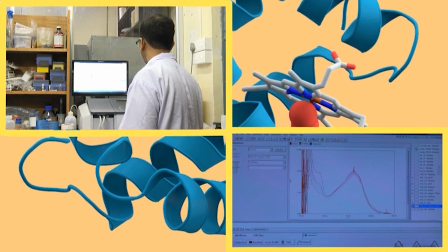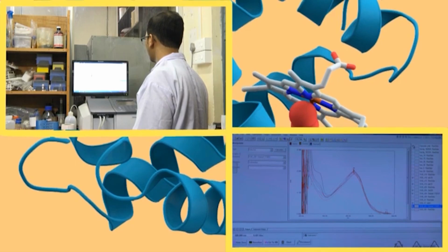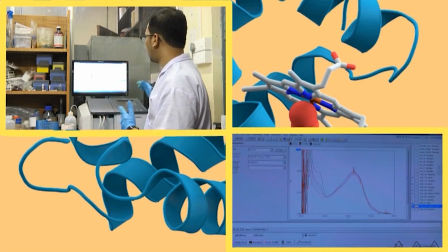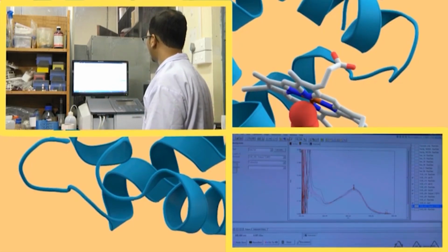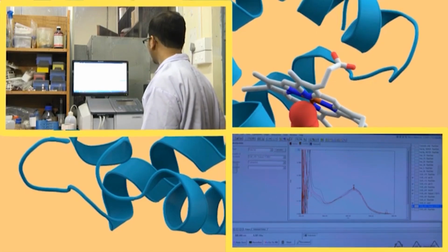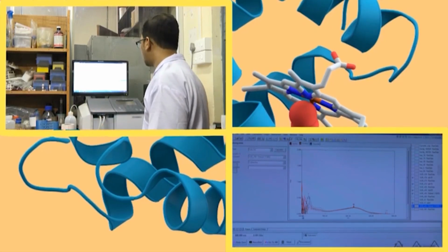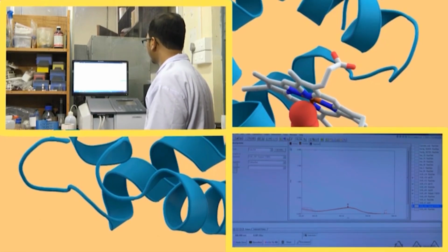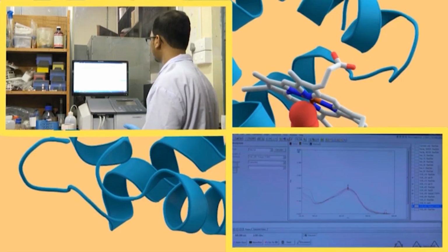And now let us enable this one. So, what we can see out here, these peaks have a bit of distribution, some are increasing, some are decreasing. If we take it 0.5, in this region 0.0, this region is not a very happy region, it is distributed in an uneven process. So, we can visualize this one from 250, and then change this value again to 0.5. Okay.